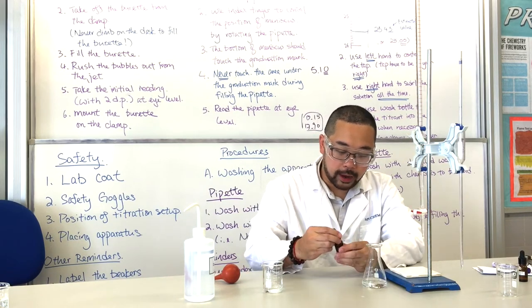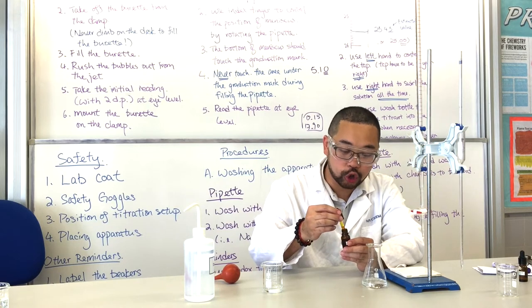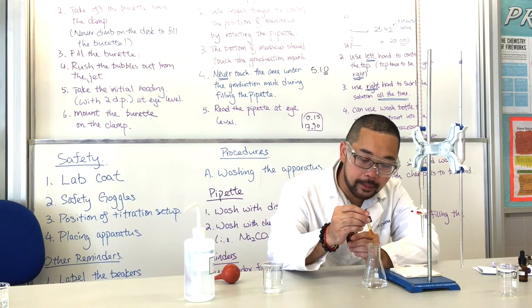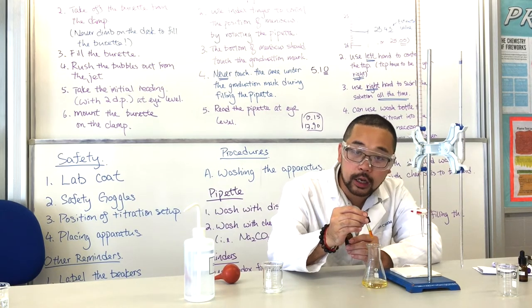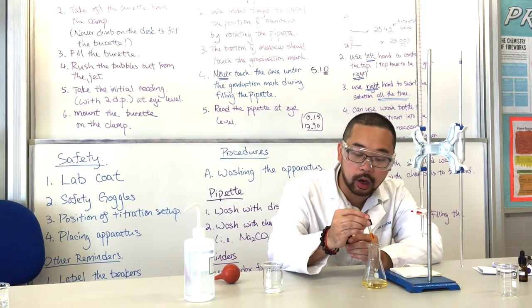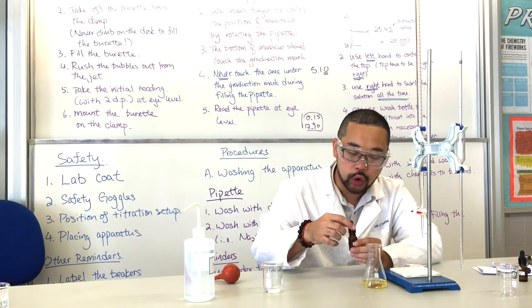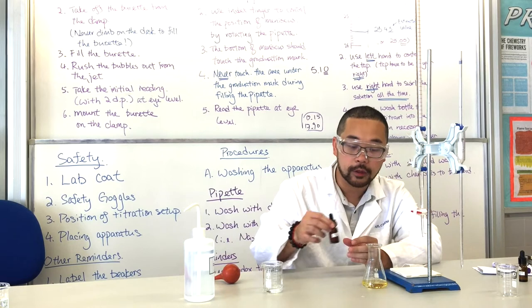For adding indicator, remember, we just need 1 or 2 drops, which will be good enough. Not a whole dropper, just 1 drop like this. If you find that the color is not intense enough, you may add another drop, but normally 1 drop will be good enough. If the color is too intense, it will be quite difficult for you to observe the color change.